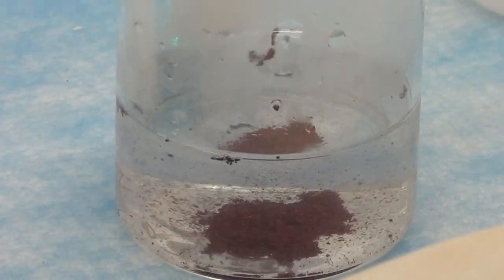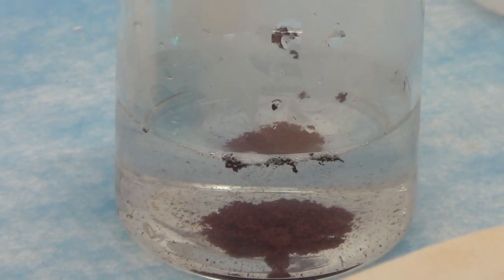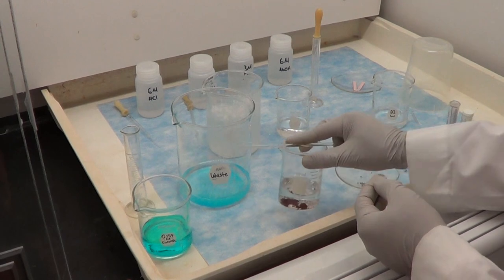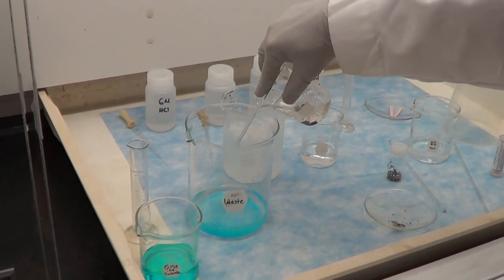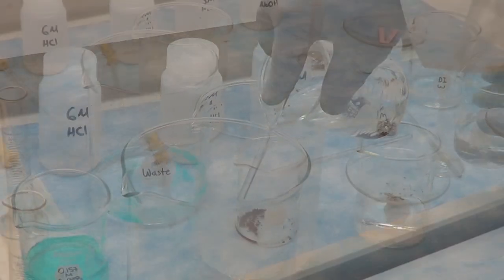Once the reaction is complete, we added six molar HCl to remove the excess magnesium. We then decanted the liquid to the waste beaker, washed with acetone and allowed the precipitate to dry.